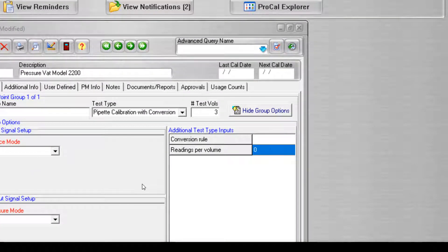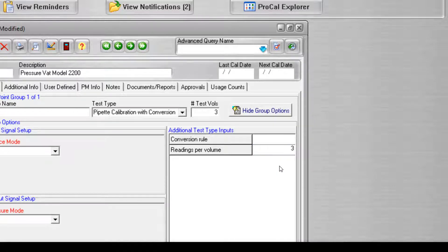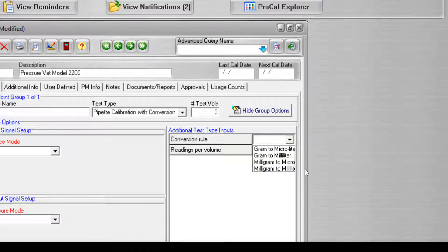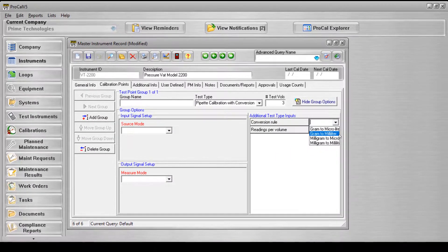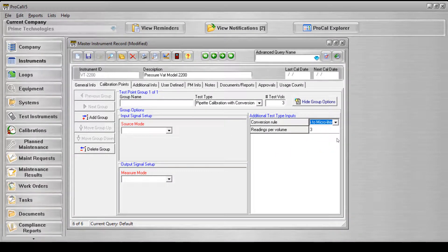The options are as follows. Readings per volume indicates the number of times the test is performed at each test volume. And conversion rule, which indicates the weight to volume conversion. Your choices are milligram to microliter, milligram to milliliter, gram to microliter, and gram to milliliter. The pipette with conversion test type package requires that there be at least two readings per volume for each test point in order to make the correct calculations.